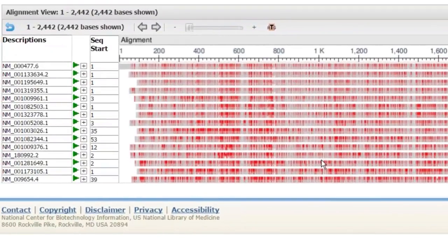And so this is a set of BLAST alignments that are opened in the MSA Viewer. So this is basically just a search of the RefSeq database on BLAST using the human albumin mRNA as a query and limiting it so that I get rid of model sequences. So I just get the NM style reference sequences.